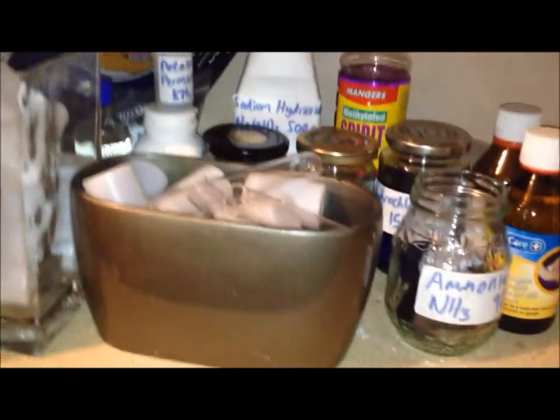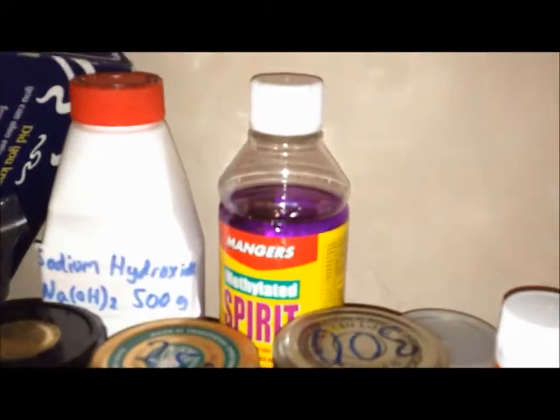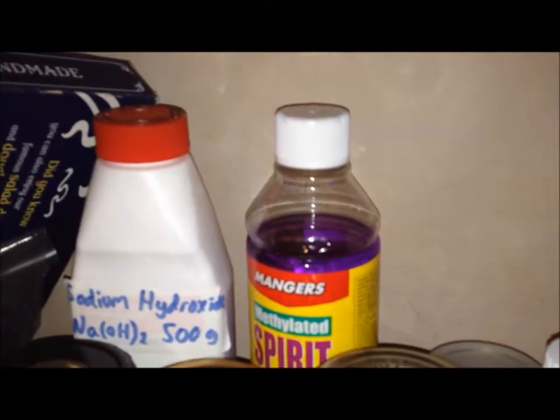Film canisters I find are very useful for storing chemicals — you can get a lot of them for free from Boots. Glassware: a 250ml beaker, a 100ml conical flask — I should really get a 250ml conical flask — and a 100ml beaker. Safety specs as always. A plastic beaker and a meth burner, which I use with my methylated spirits. It's a good source of flame, and of course plenty of jam jars.